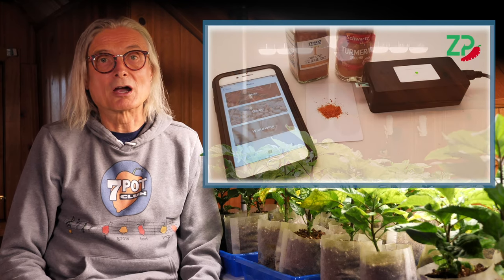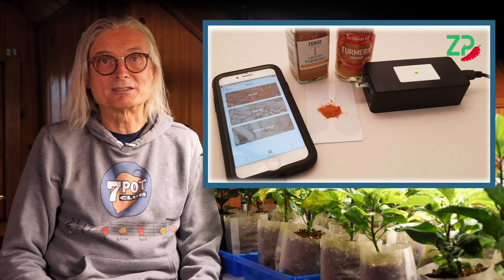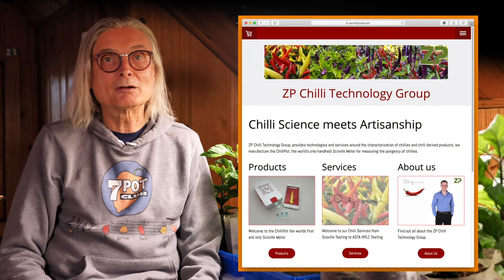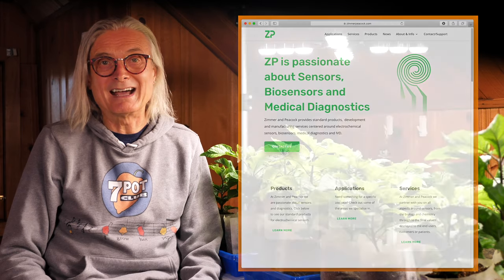There are unconfirmed claims that other varieties are over 3 million SHU. Now, Chili Pot is not new — it's been available for a couple of years. This unit is also marketed as the Food Sense Meter because it can also test other properties like the pungency of garlic and the amount of sulfites in wine. It's a product of ZP Chili Technology Group. ZP stands for parent company Zimmer & Peacock, a developer and manufacturer of biosensors and medical diagnostics.